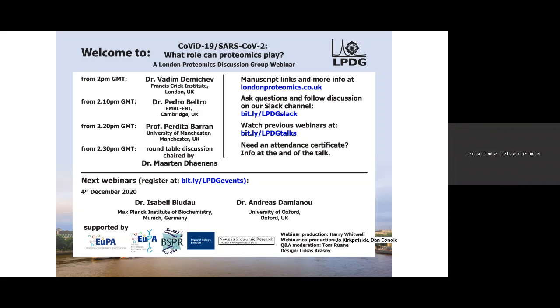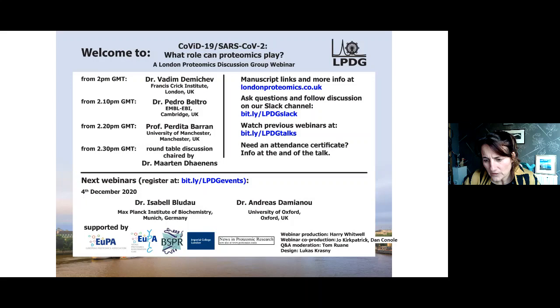So I don't know. Listen, we have a brief, which is quite common in trying to get any test through accreditation, which is to have a reference standard to compare it with. And of course, we all might say, well, that will be the mass of the peptides or their sequence, which mass spectrometry tells us. But that's an internal view. So we are using the 2020 flu antigens as a reference standard or for specificity, right? So we're using them for that. If we find them, we find them, and that would be a bonus, but we can demonstrate that that's something we can do.